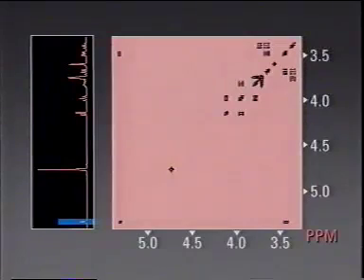Look again at this left-hand doublet. It's coupled to the doublet of doublets here because there's a squared pattern based on them. On the other hand, this resonance is not coupled to any of the others because it doesn't form a squared pattern with any of them. Of course, this is the HDO signal, so it makes sense that it can't be coupled to any sucrose signal.